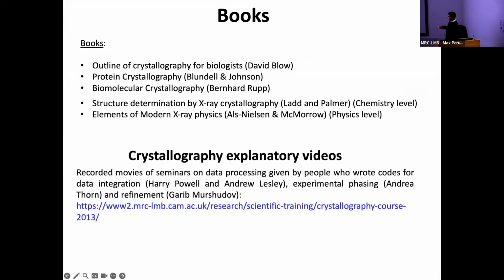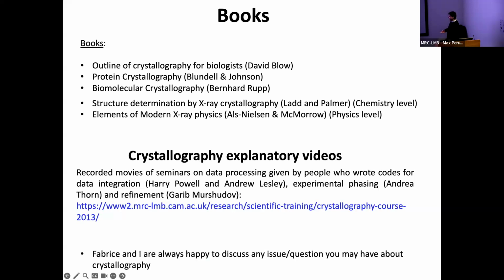There are some lovely explanatory videos on the LMB page, most of which were done by people that actually wrote the programs for data processing, like Andrew, Ari, Gary, Andrea. Me and Fabrice are always happy to help you if you need.